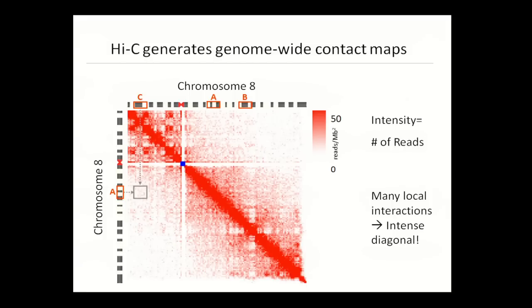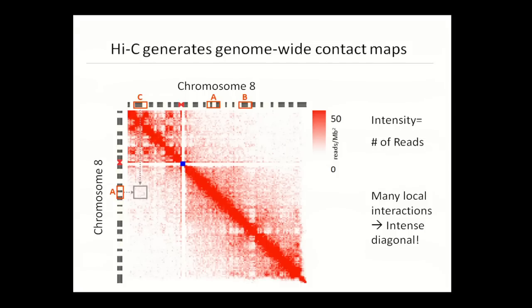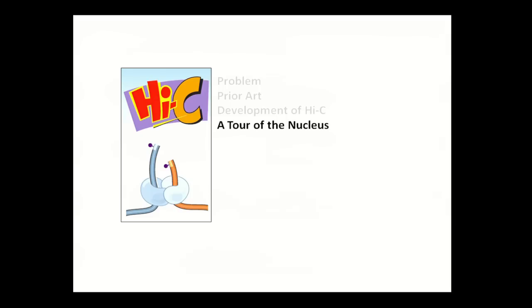There's some complexity here, right? There's polka dots, there's a little starburst. In fact, this localization effect, that locus A is always close to itself, holds for all loci on all chromosomes of all organisms. Whenever you've done a successful Hi-C experiment, you should always be seeing these diagonals. But the critical point is this is really a fundamentally 2D data type. It doesn't like to live in the UCSC browser, and it points towards the fact that we might need new ways of thinking about proximity data.